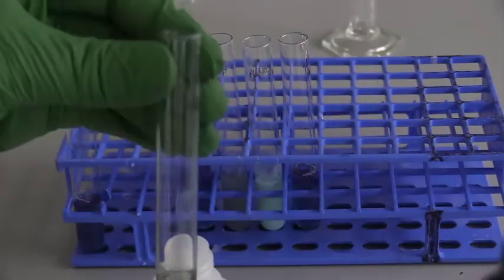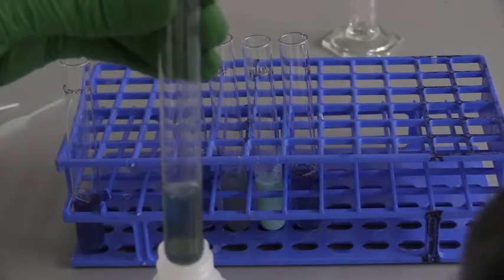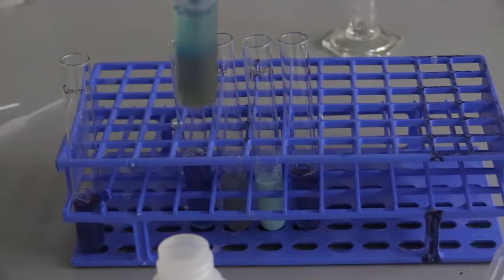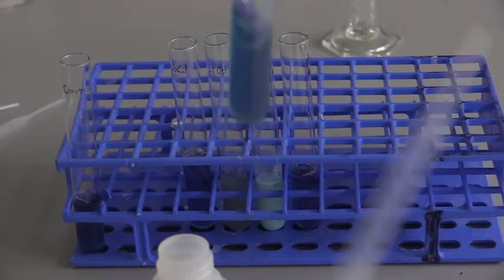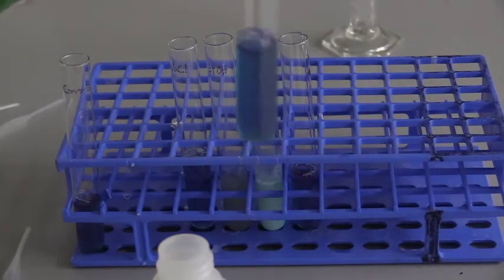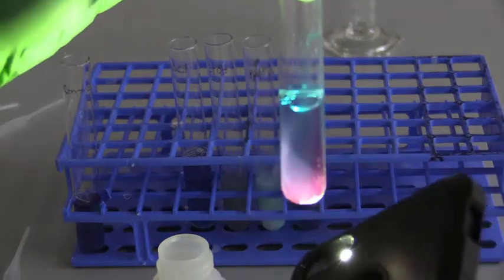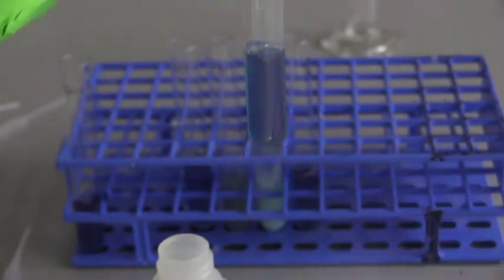And now we will add 1 ml of HCl to that tube that just had sodium hydroxide added. So you can notice the color changes and the light shine on the sample. What do you observe?